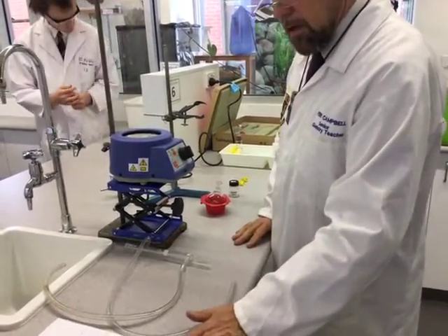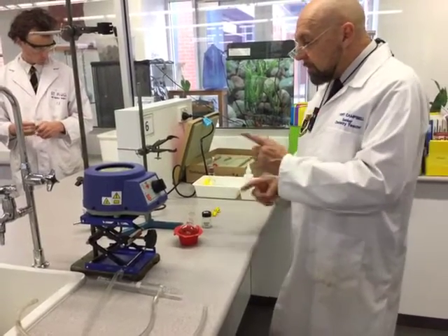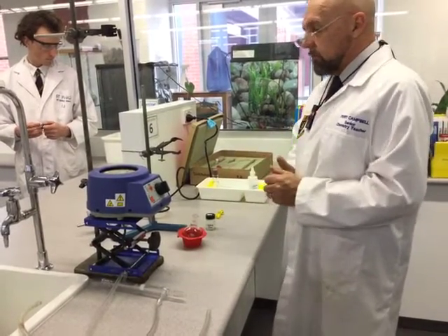What we're going to do today is set up for reflux. I'm going to go through some of the equipment first so you know what it's called and basically what it's used for.